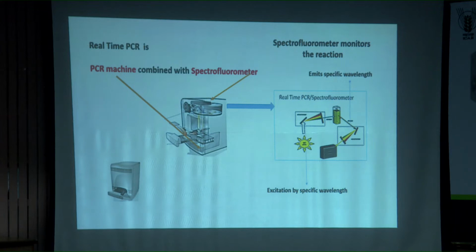One of the greatest advantages of this PCR machine is that the excitation is provoked by normal light, a kind of blue light. It's not a UV light. So that brings some safety into the whole story, right?